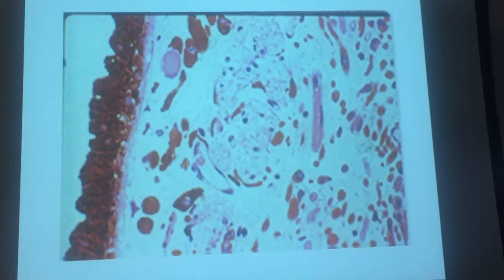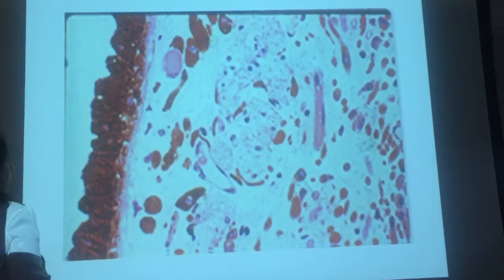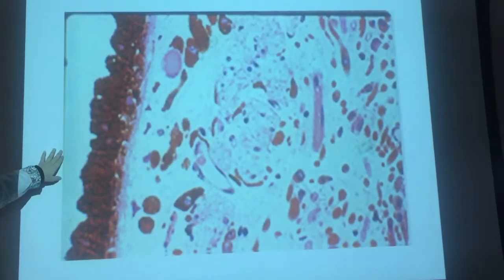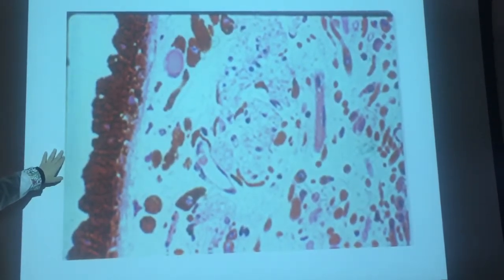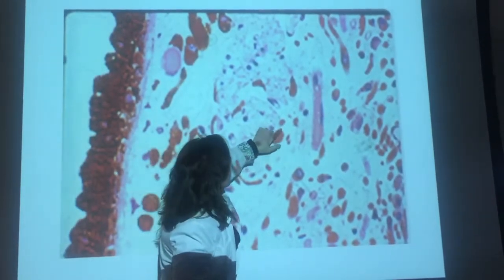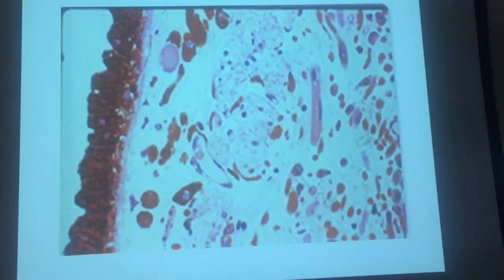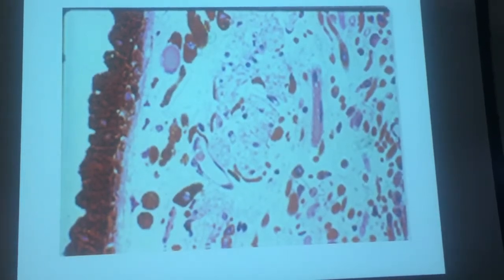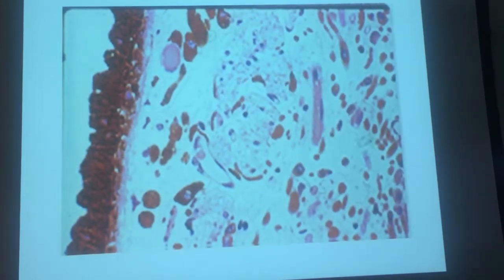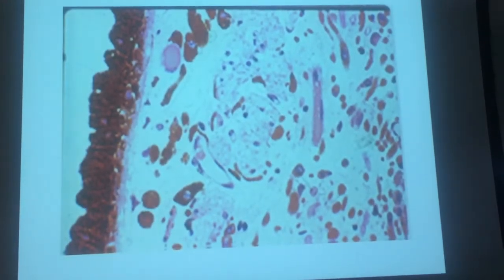So this is the iris. The reason why you know that is because it's got a lot of color to it. And this is the back of the iris, so this is going to be the posterior chamber of the anterior cavity. Think about the anterior cavity being in front of the lens, the posterior cavity being behind the lens. Right here you see granules with lots of melanin in them, and they're called melanosomes. Some means body, melan means brown or black. So a melanosome is basically a granule with melanin inside. And this is the pigmented epithelium. Pigmented epithelium, remember that's iris.